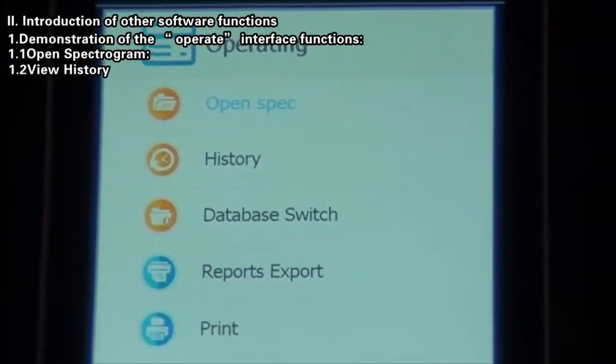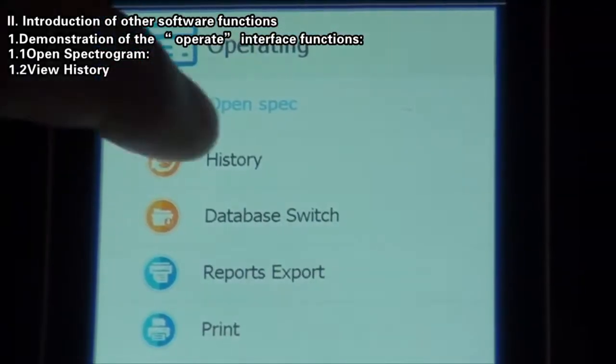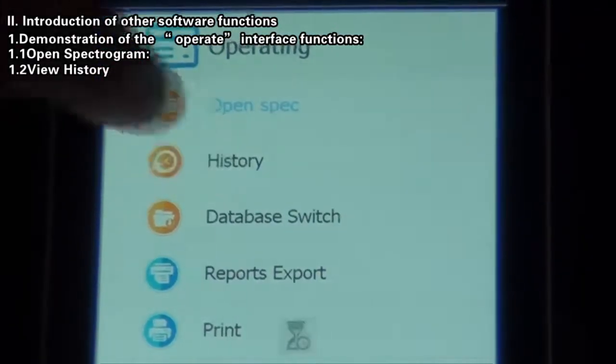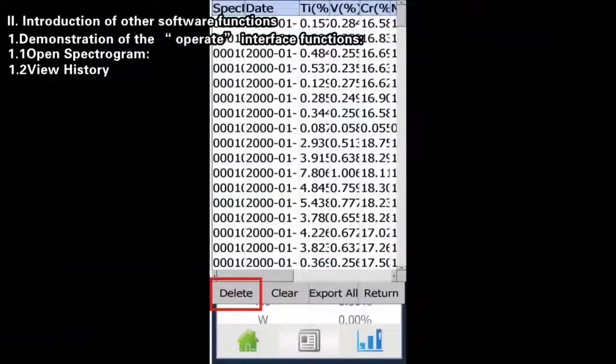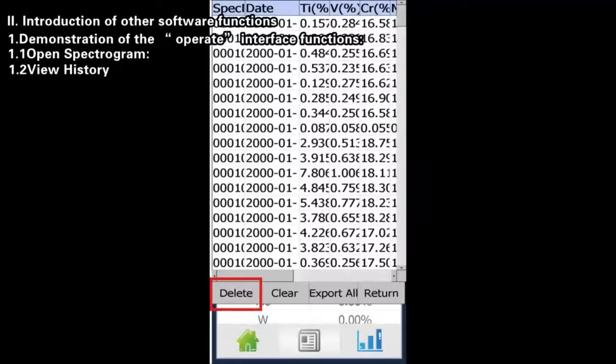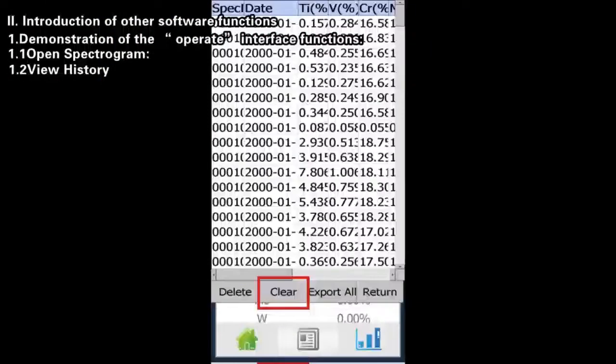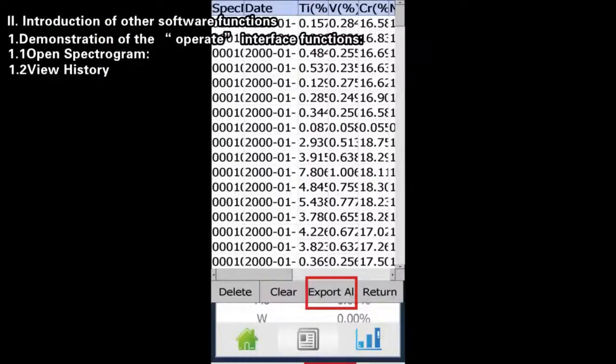View History: Click the History button to view history records and carry out such operations as Delete, Clear or Export.